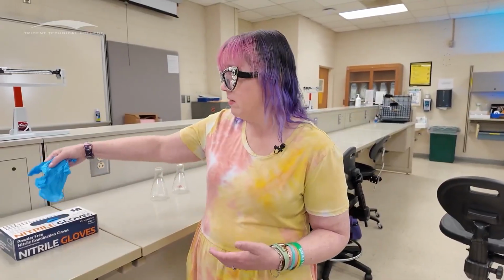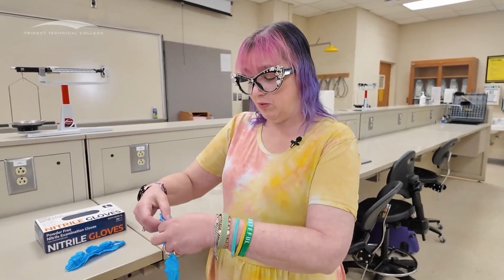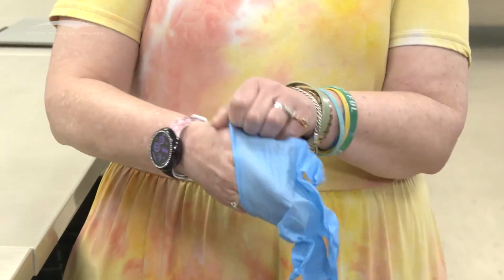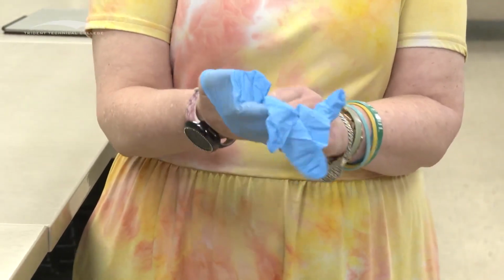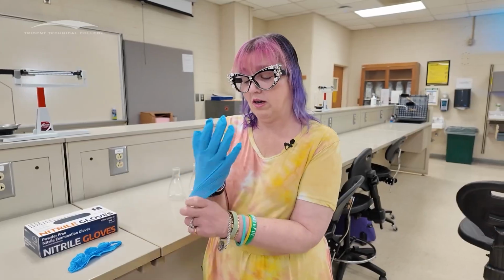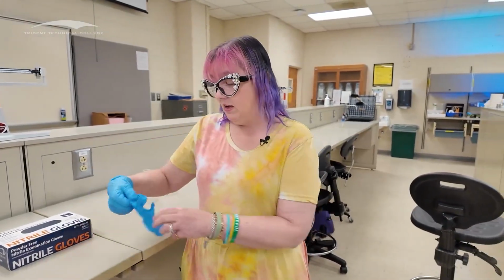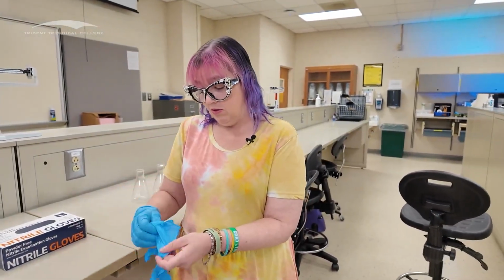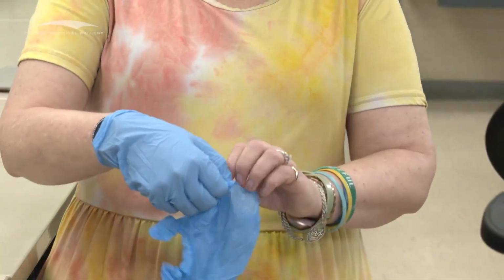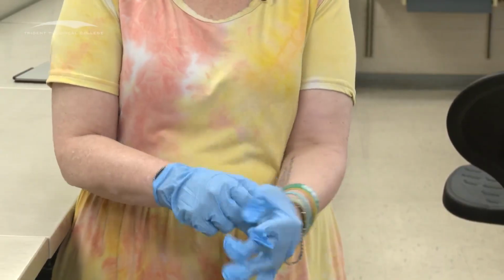So let's talk about how we put those gloves on. So we're going to take gloves out of this container. Here's 1, here's 2. I'm going to set those down. We're going to make sure that we put them on appropriately. So we want to make sure that we get our thumbs into the thumb spots on our gloves. So that's 1. I want to get that over my watch because I want to make sure I don't kill my watch while I'm wearing it. And then I have my second one, if I can get this thing sorted out because they're all shoved in there and not necessarily easy to put on.